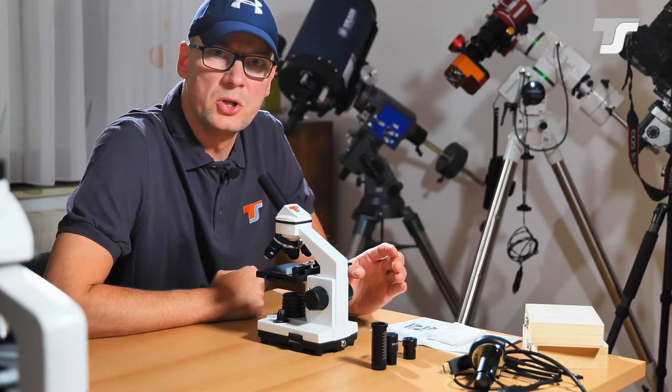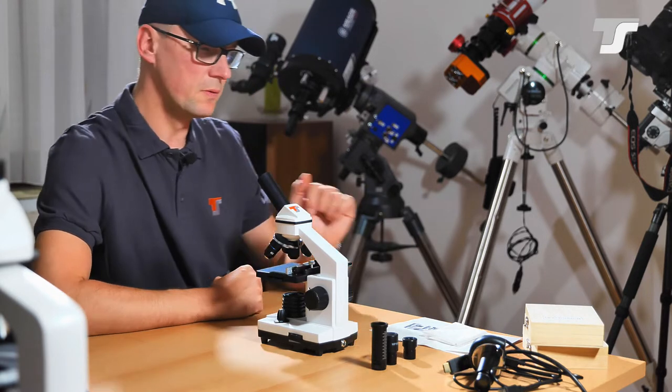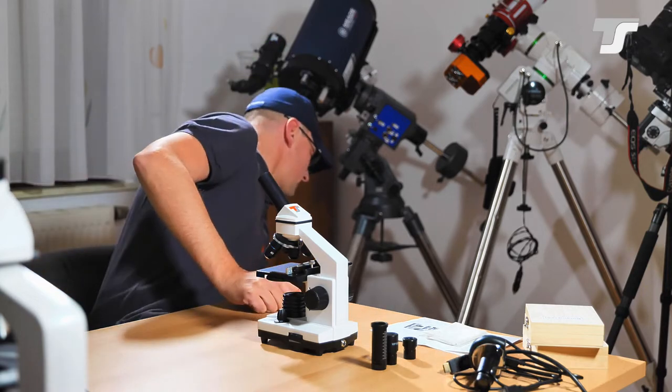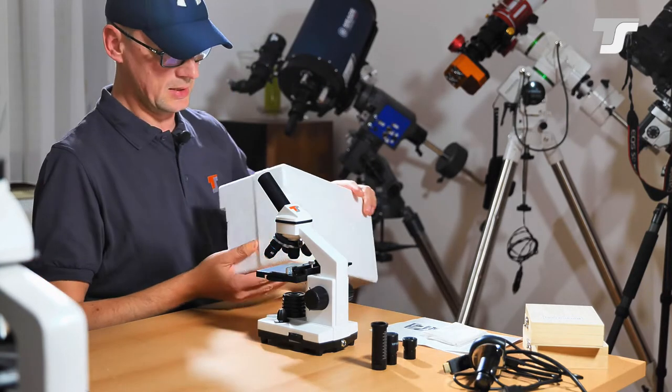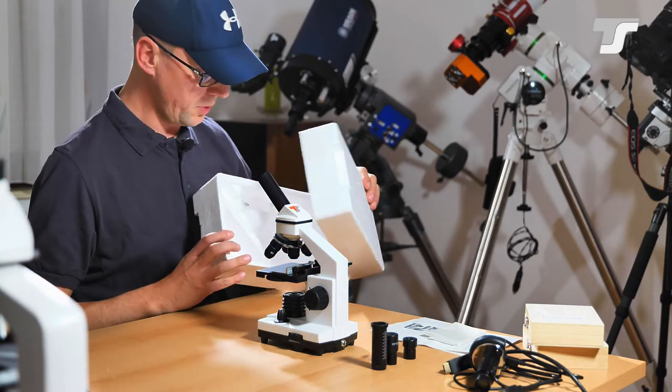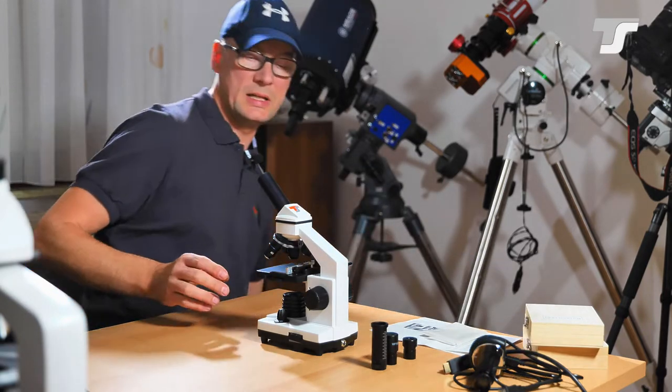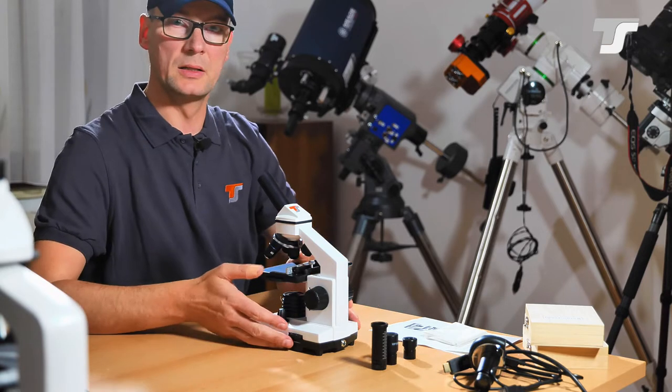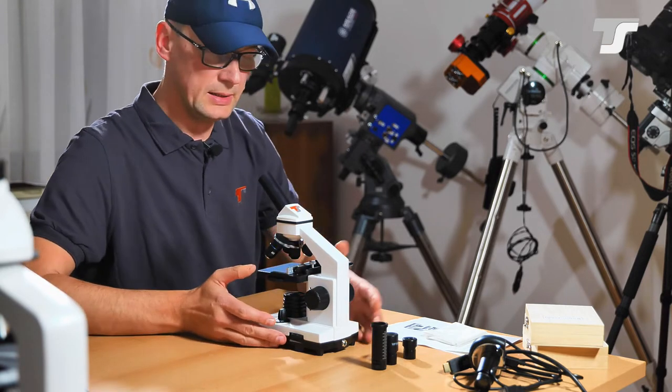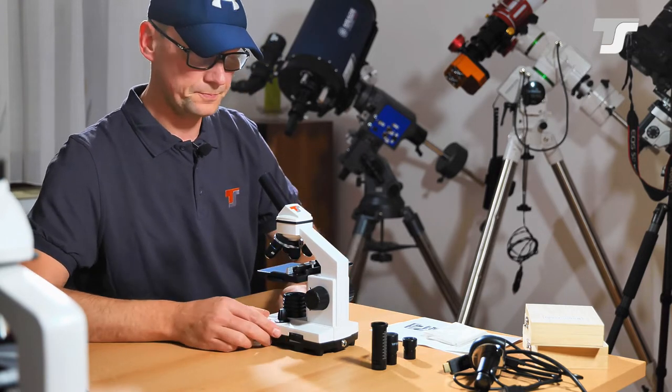First of all I'll show you what's in the box. What you get with the microscope. So it comes in this foam box here. And here you can also see the size. It's very compact. It's super easy to carry around. No problem.